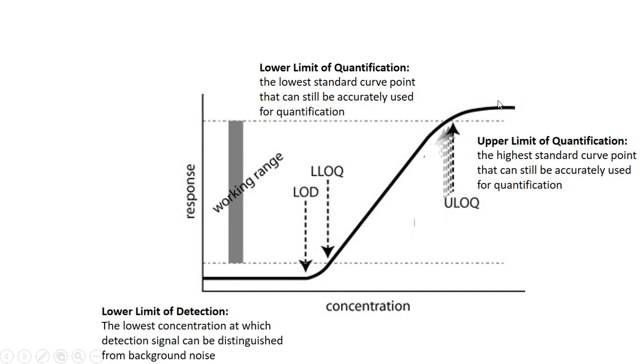Okay, so from using these three values, you can establish in what situation you can accept the result as reliable. So if you get an absorbance anywhere here, okay, then you can't rely on it. So this whole area of the standard curve is useless.